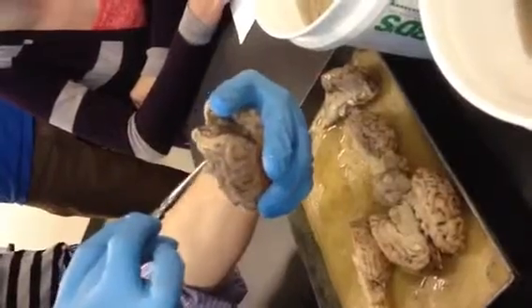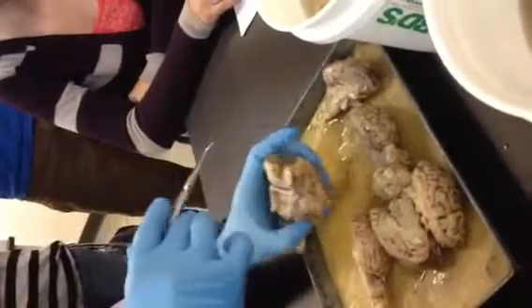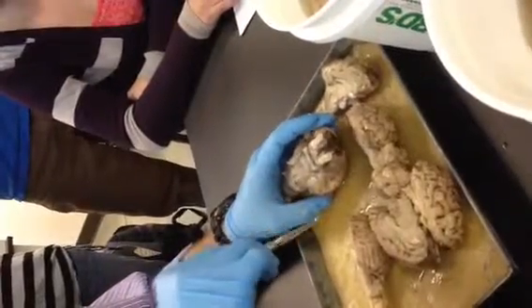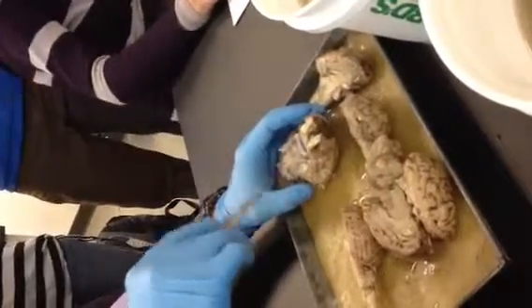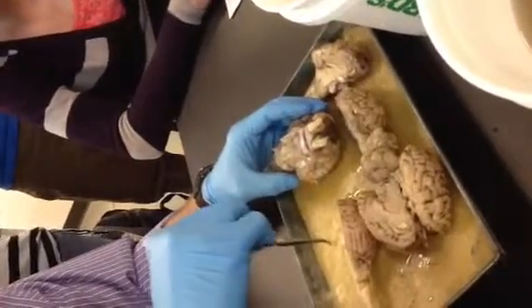Optic chiasm. Okay. Optic tracts. You're not going to see the optic tracts on here, but here's the way we'll do this, and I'll just tell you right now. On the sheep brain, the only two cranial nerves that you'll have to identify will be the olfactory and optic, 1 and 2. Now there are 12 cranial nerves, okay? But they're hard to find on these because they are so fragile.